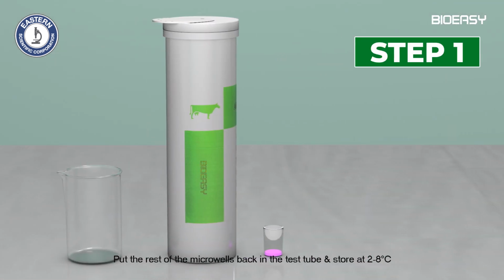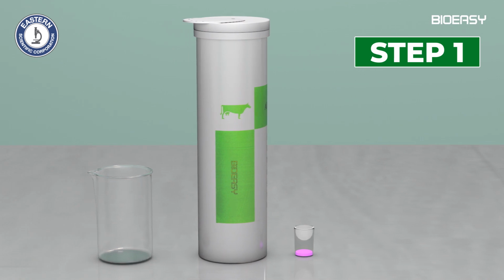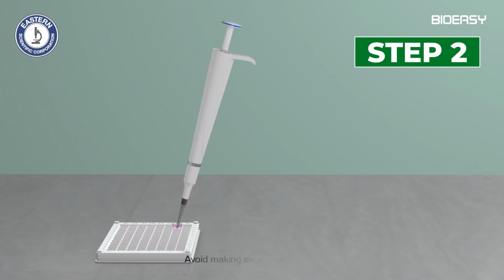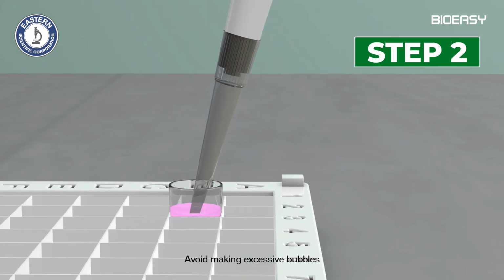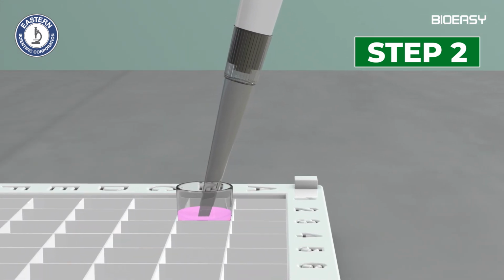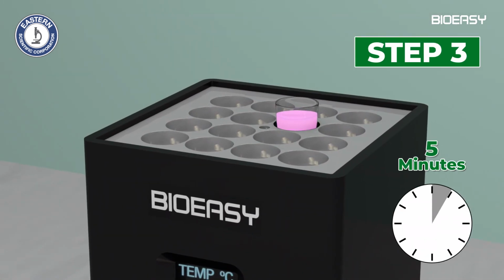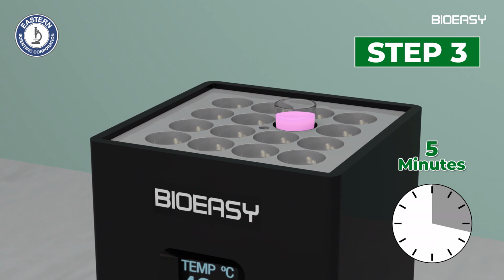Step 1. Take required number of microwells and dipsticks from test tube. Step 2. Pipette 200 microliters milk sample into the reagent microwell and mix well by pipetting up and down 5 to 10 times. Step 3. Incubate 5 minutes at 40 degrees Celsius.